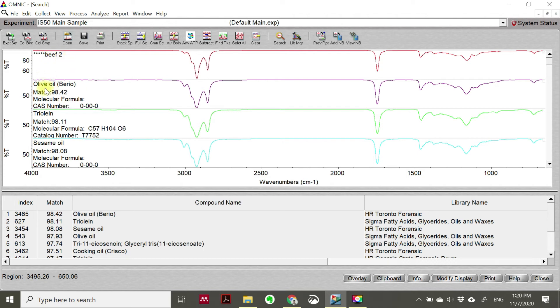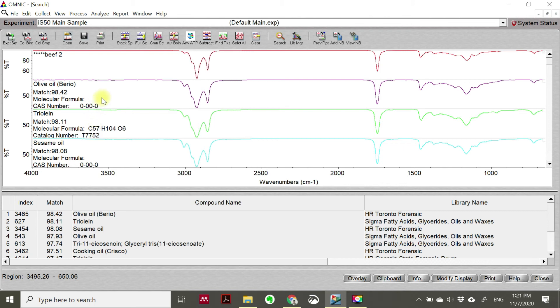So what we have here: this is your sample - your beef oil - and this is the first or highest match against your sample. So this is olive oil, then sesame oil, and these are the highest matches against your sample. Even though you have an animal-origin extracted oil, it cannot be differentiated by the library - the library is actually suggesting two or three possible matches which are plant-origin oils.